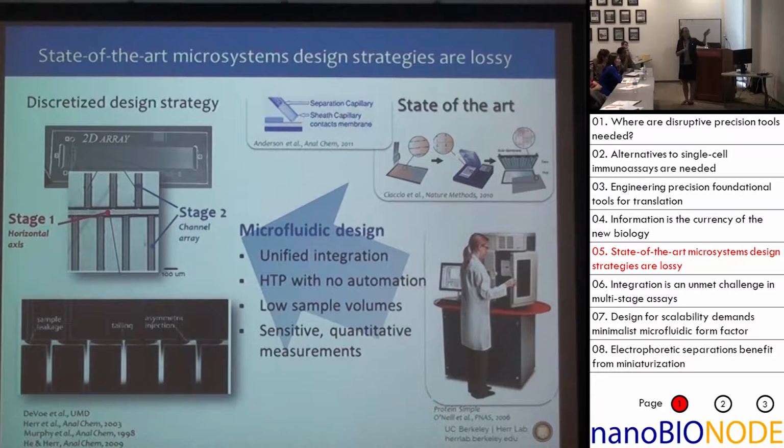And then you might imagine in each one of those channels, I might have an immobilized antibody, let's say, against my target. So I do my immunoassay in those little network of intersecting channels. So I can basically say, does this fraction of protein from the first stage of the assay contain HER2 protein, right? And so if that protein sticks there, then yes, it is HER2 positive. If it goes right through immobilized protein, maybe it's not HER2 positive. No one's actually done that to my knowledge or used this for a Western blot, but you could imagine that.